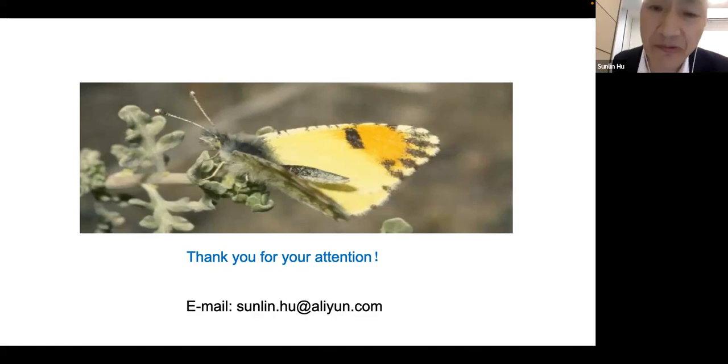So we try every means to avoid contamination, and after we get a sample, we will also get a control sample. If there are diatoms detected in the control sample, the target sample maybe cannot be used.